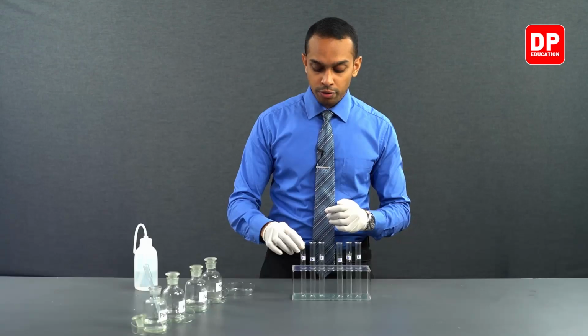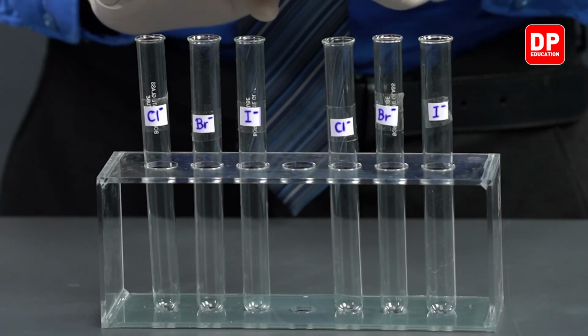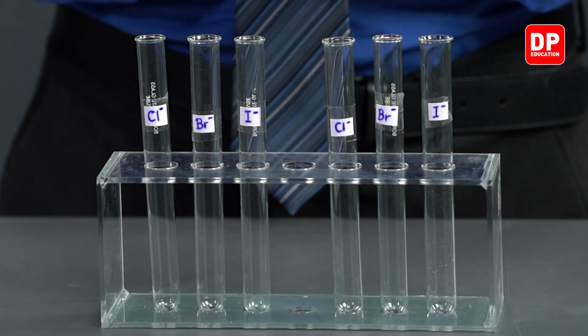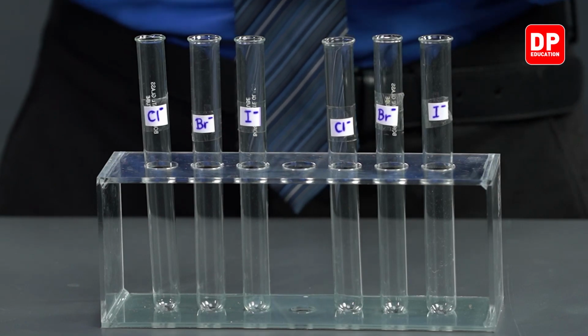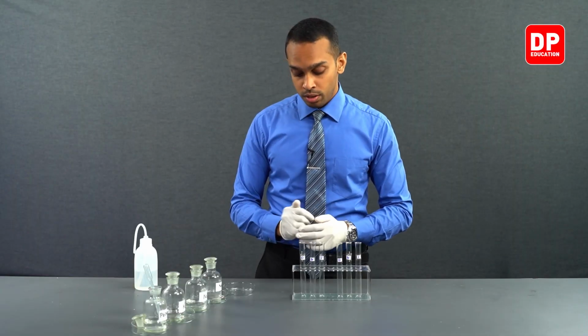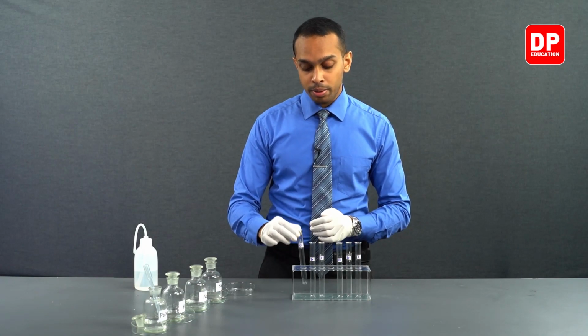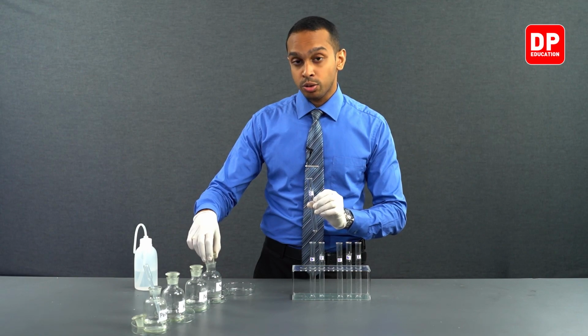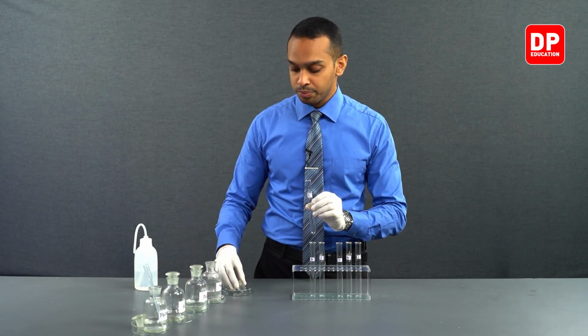Without further ado, we have labeled our test tubes because it will be easier for us to identify what solutions are in them. To an already labeled test tube, I will be taking a little bit of sodium chloride solution.